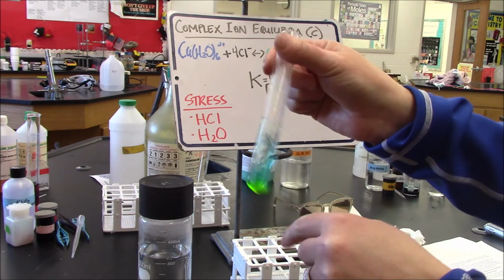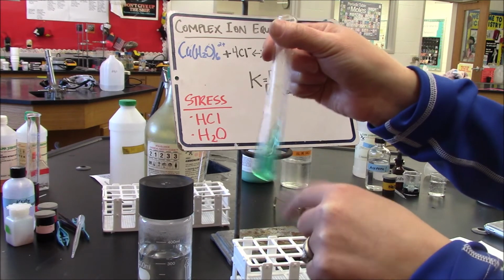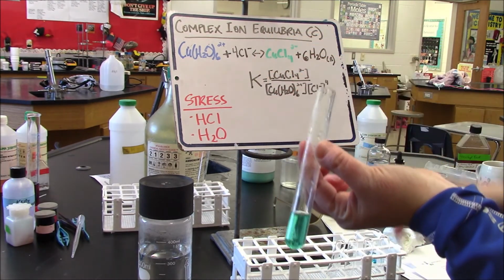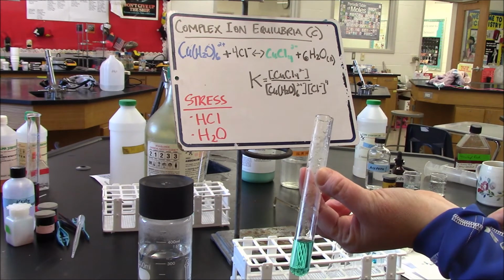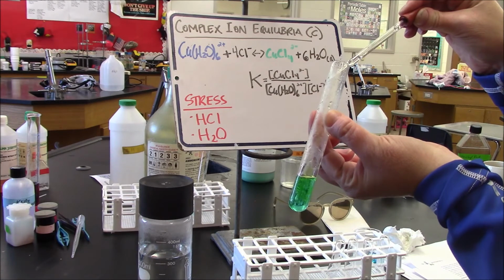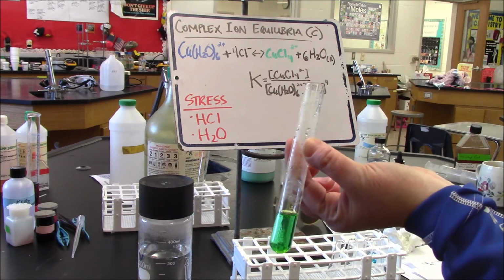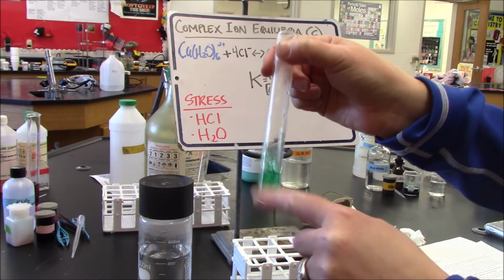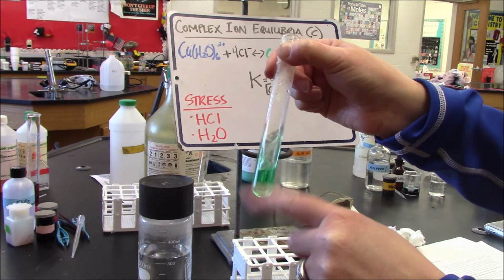Chlorine is replacing water and forming a new complex ion. I think I can even add a little bit more, although that just means I'm going to have to add a lot of water to drive it back. Okay, so I have the green solution.